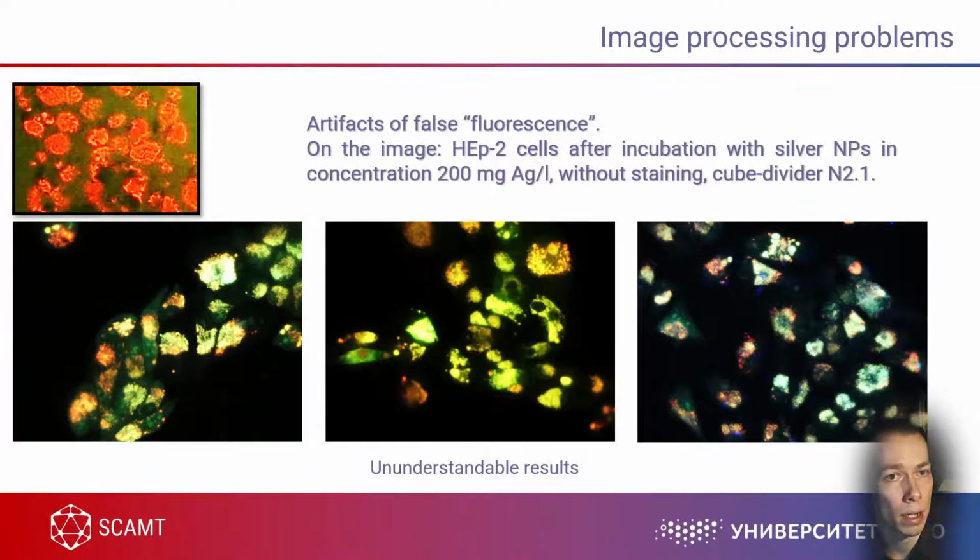And the correct answer, what to do with this, how to explain this result, is just remake it, just redo your experiment, because if you cannot explain, no one will explain for you. It's just something wrong happens with your protocol.